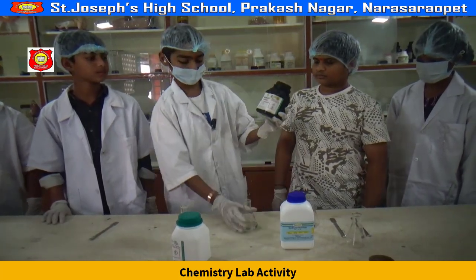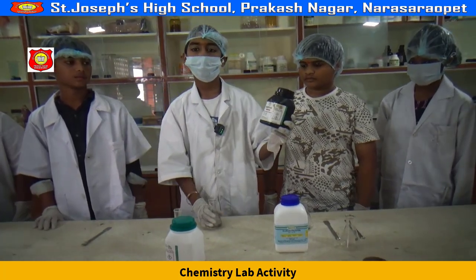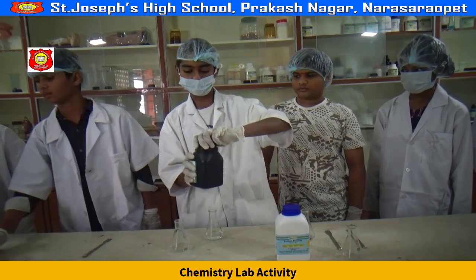Now in another beaker of distilled water, we're going to add ferric chloride anhydrous. So, what is the meaning of anhydrous? Anhydrous means it consists of no water molecules. Now, we are going to add it.